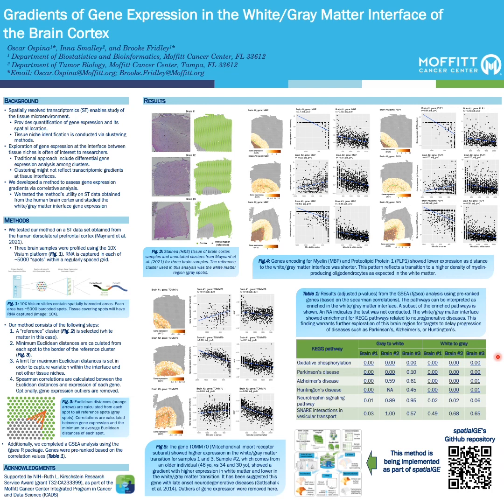We are implementing this new method as part of our analytical suite, Spatial GE. Spatial GE enables analysis of tissue gene expression for spatial transcriptomics data. A QR code to the GitHub repository is at the bottom right corner of the poster.